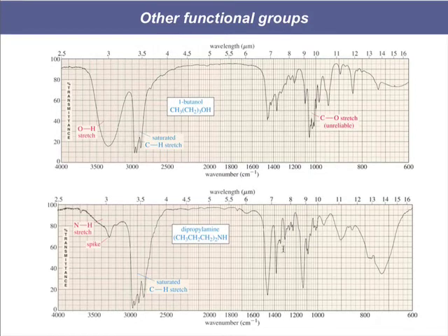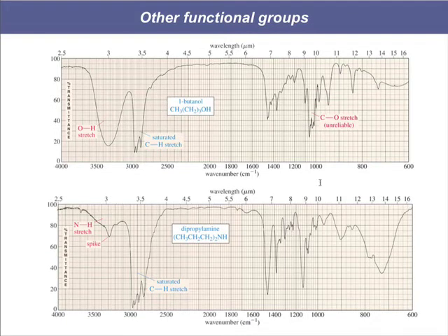We've got similar things going on here. That's why these are not reliable, because if you look at this and say, oh, this must be a CO stretch, it's actually not. So don't put too much credence in anything below 1400.